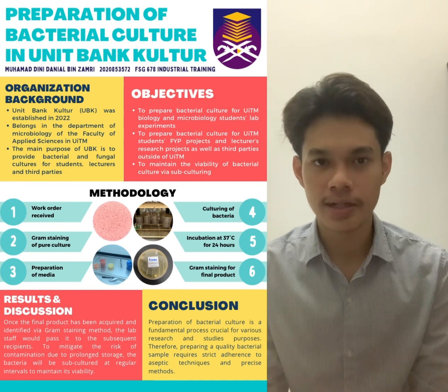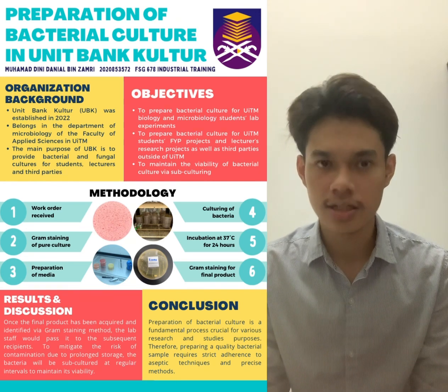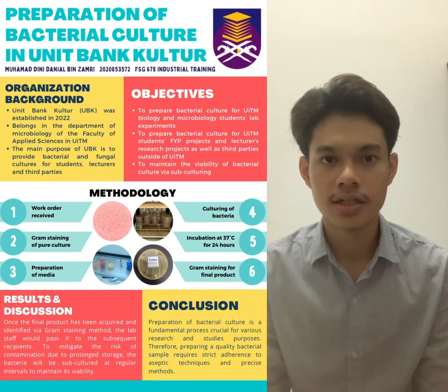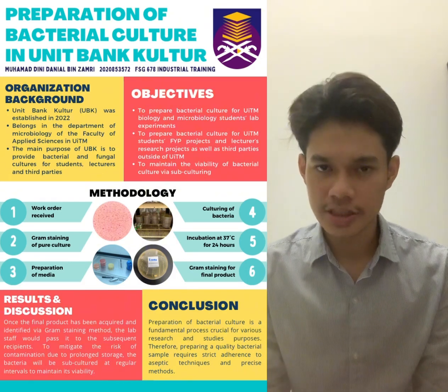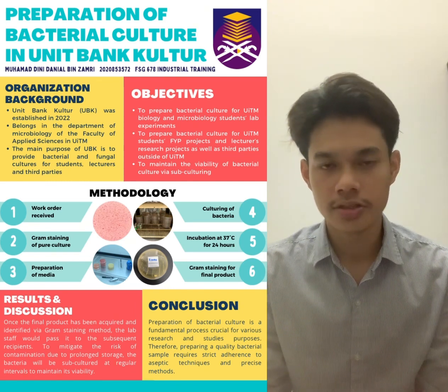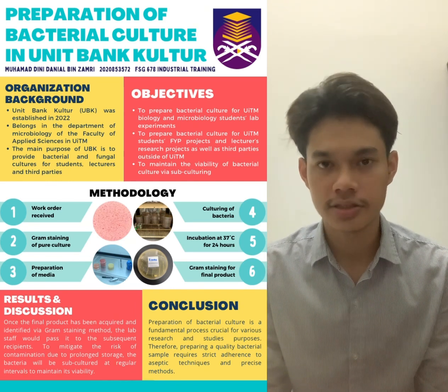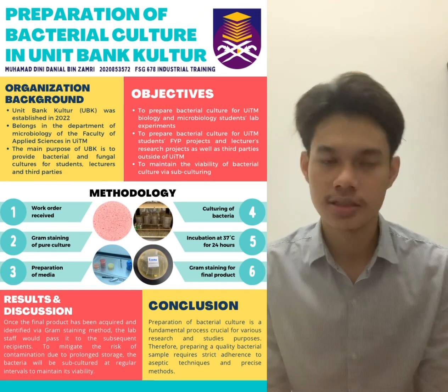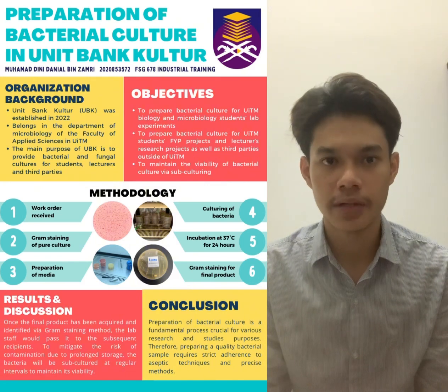Next, we move on to the objectives of my task during my internship program. The main purpose of my task is to provide bacterial culture for biology and microbiology students for their laboratory practical experiments. In addition to that, I'm also responsible for bacterial culture preparation for the students' final year projects and the lecturers' research project, as well as third parties that require bacterial culture such as USIM, Matrix, or UPM.